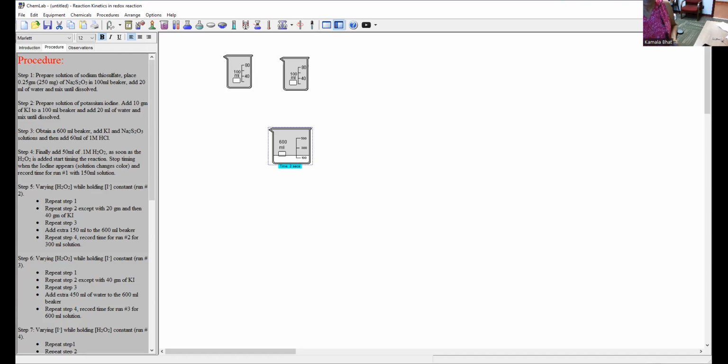Please keep an eye on the solution so that as soon as it changes color, you can record it, because it takes a lapse of time to turn off or pause the timer. So you can see that it's going. Okay, at 27 seconds the solution changed color. And you can see it takes me 3 seconds to quickly get onto the timer and pause it.